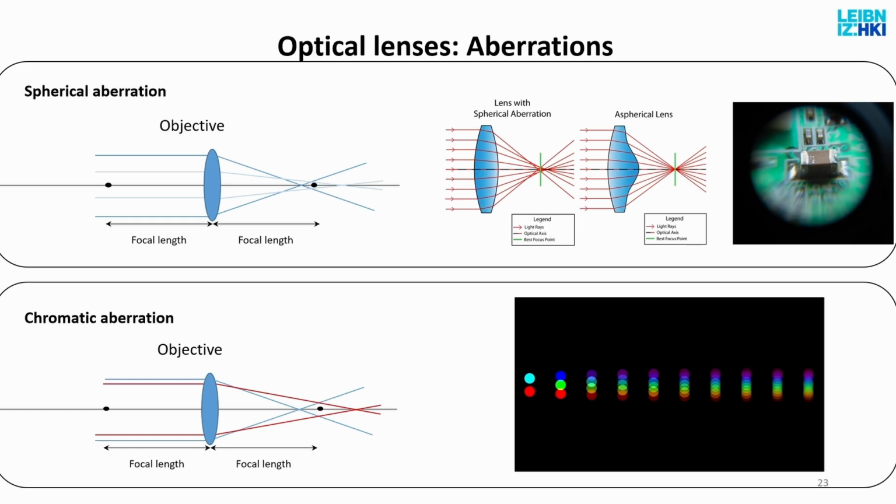So because of that, when you set up your microscope, when you set up your first experiments, especially when you're using high resolution, micrometer or so object size, then you must check your images for chromatic aberration. That's the first step you have to do. You have to assume that spherical aberration is correct, because if not, you can't do anything about it. But this one you can, because if you measure the chromatic aberration, you can compensate for it in the image analysis step. It's not all lost if there is a chromatic shift, if you know it.